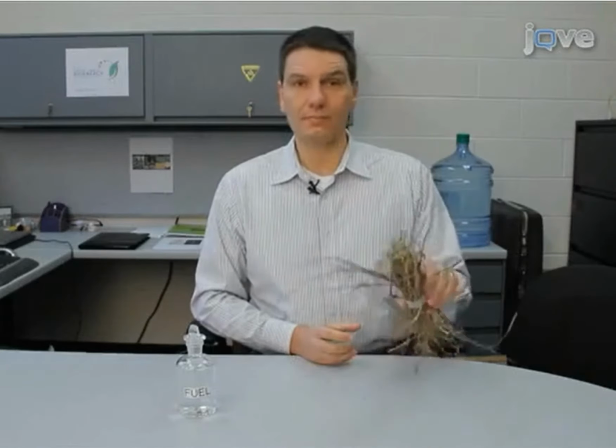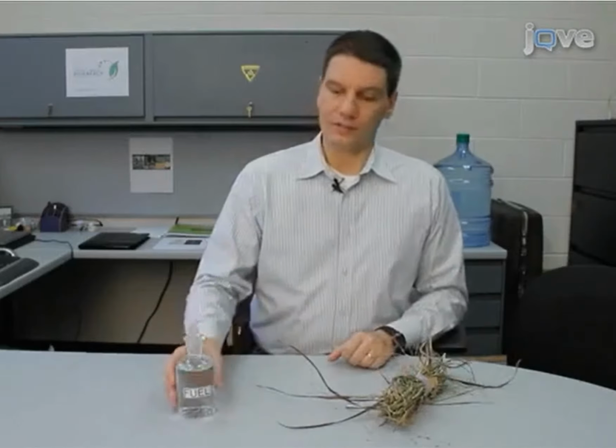Here at the Great Lakes Bioenergy Research Center, we develop technology to convert these sugars into biofuels. In order to identify an optimal plant feedstock, we first need to assess the kind and abundance of sugars that are present in this biomass. In another video entitled Comprehensive Compositional Analysis of Plant Cell Walls, Part 1, Lignin, we will focus on the polyphenol analysis. So let's get started.